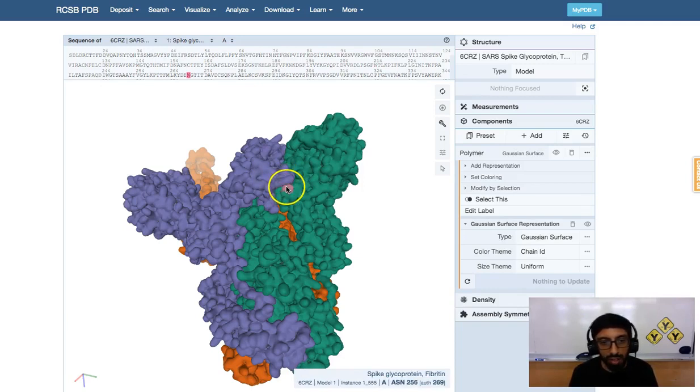This is an arginine, and this right here is an asparagine. And I could postulate what kind of an interaction might be happening between those amino acids, right? So again, the amino acid is identified in the lower right, and it's actually highlighted up here as well. And so you can actually see which amino acid is each little spot here.